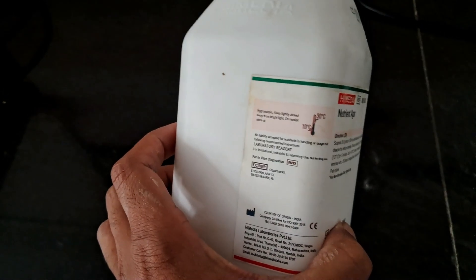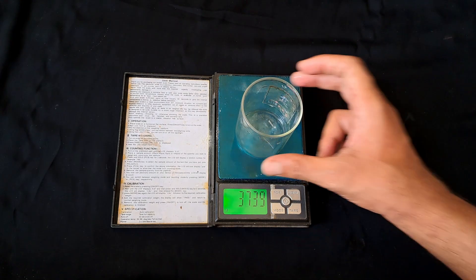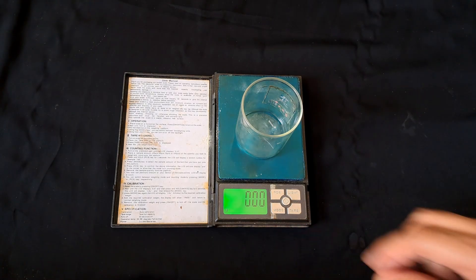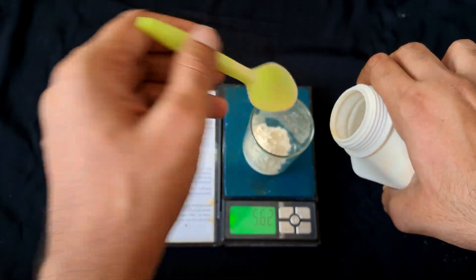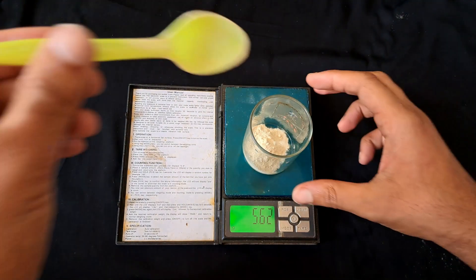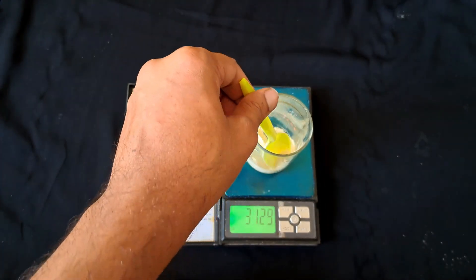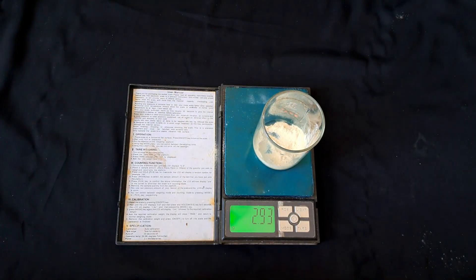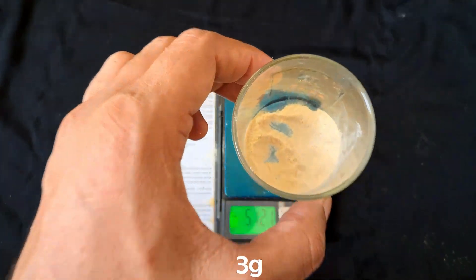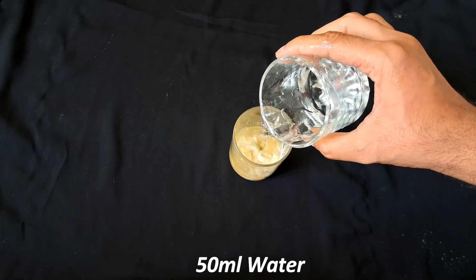So after all, I decided to bring the nutrient agar from my university lab, and now we have to do the whole process again.